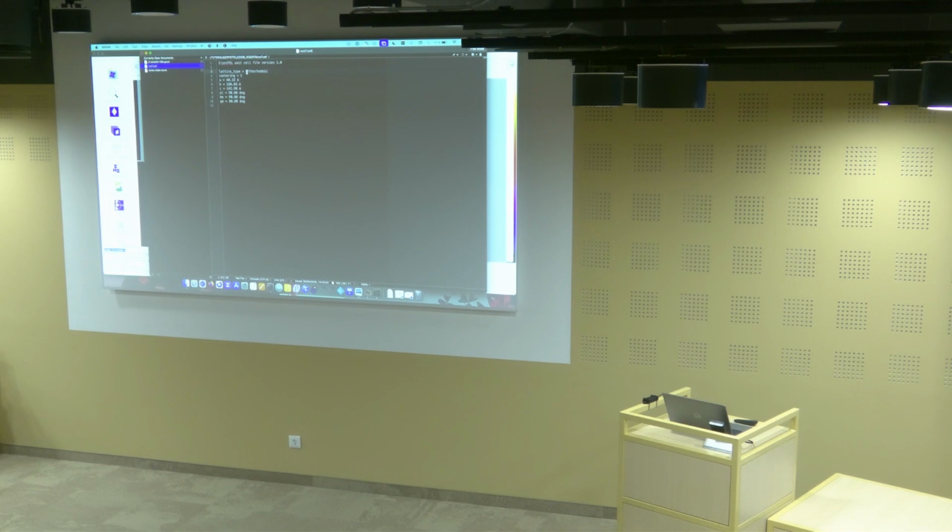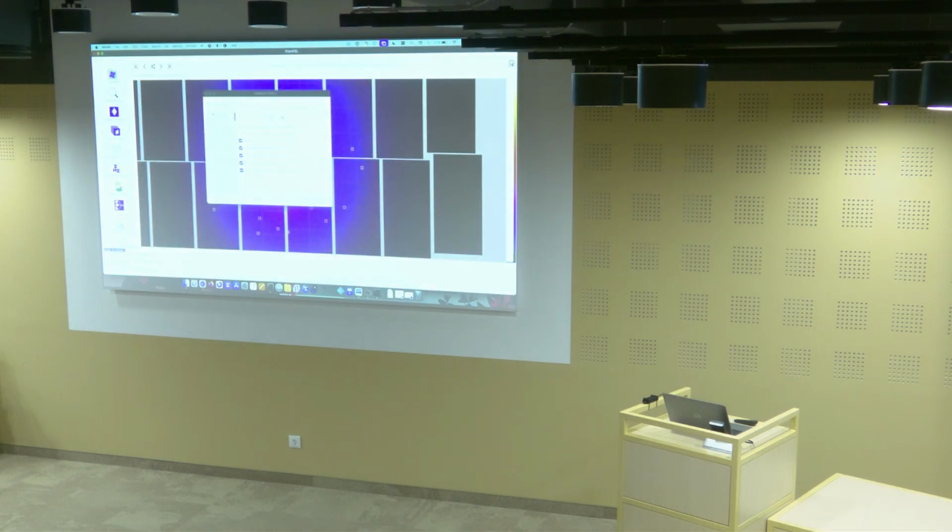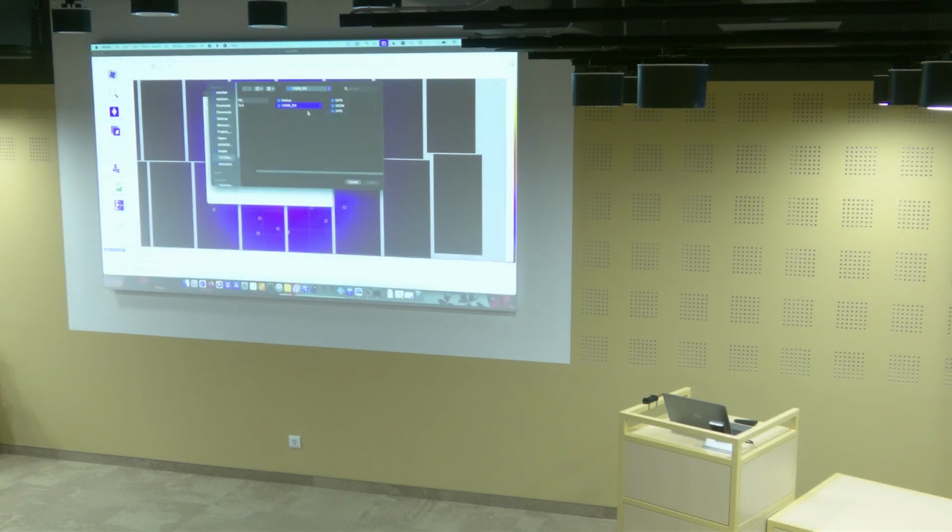We're going to give it the lattice type, which is orthorhombic, the centering type, and then the axis of the unit cell. So that's the A, B, C, and then the angles. Since this is an orthorhombic cell, the angles are 90 degrees. So this is also the information that we're going to give. So we're not really giving the space group. We're giving the lattice type, the unit cell, and the centering type. I put the cell in here.